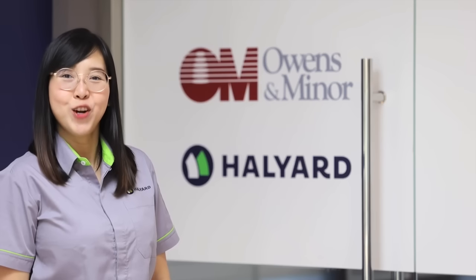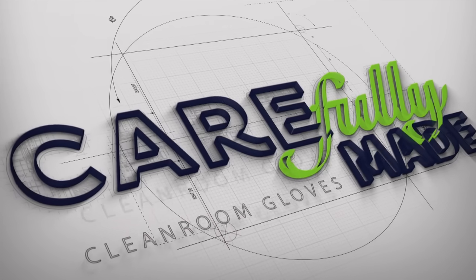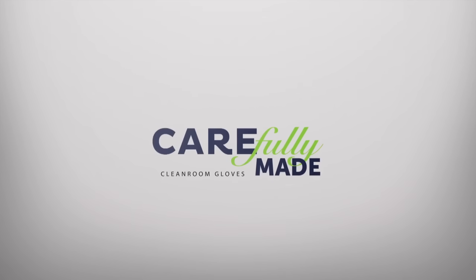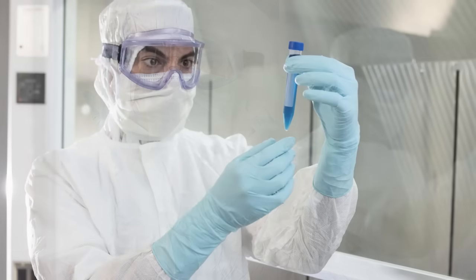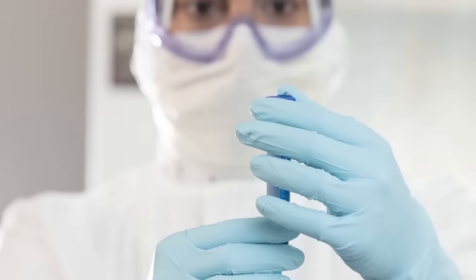My job helps protect people, processes and products in cleanroom manufacturing environments. Cleanroom gloves are used to protect products from contamination and to protect workers with effective barrier protection against chemical splash, microorganisms and viruses.